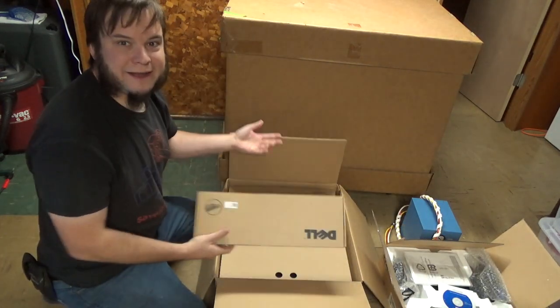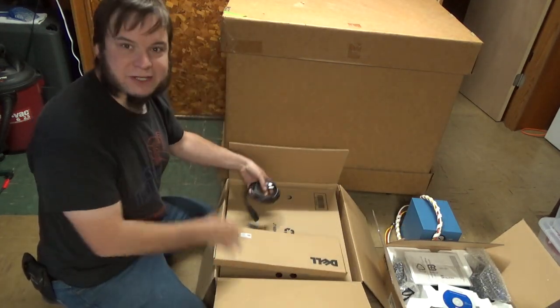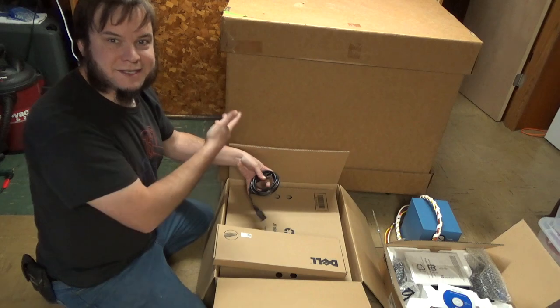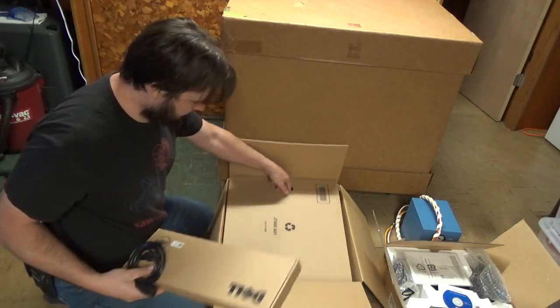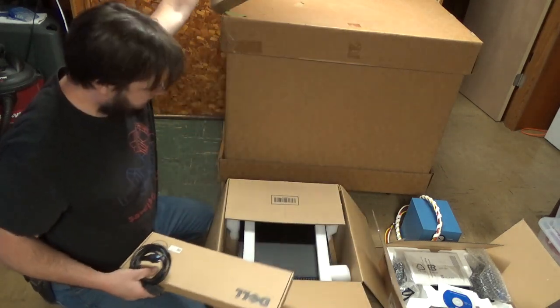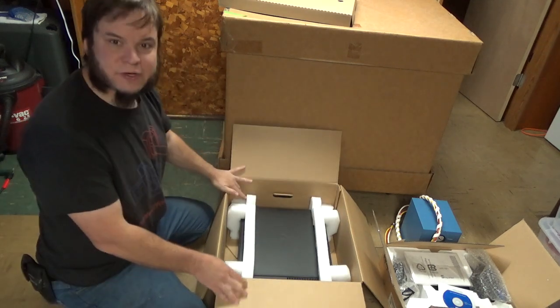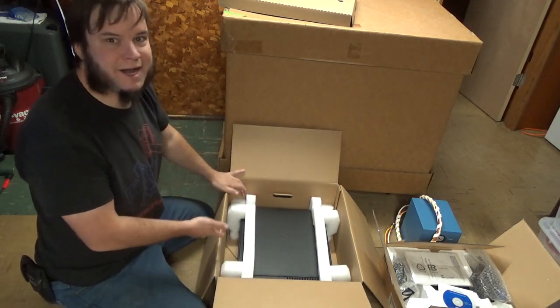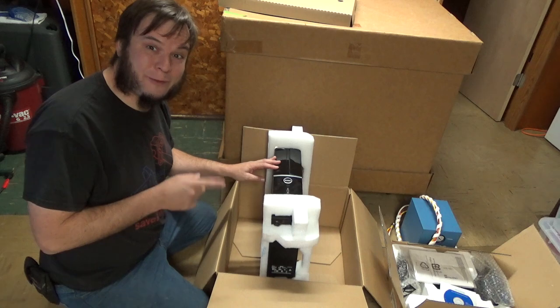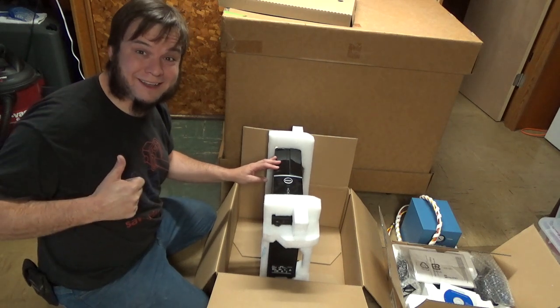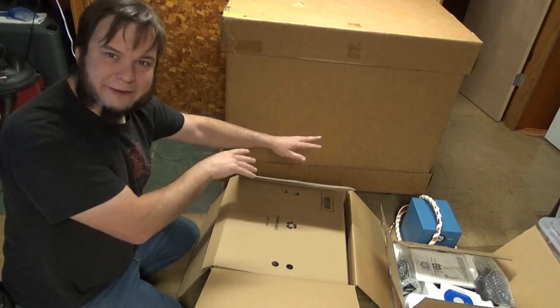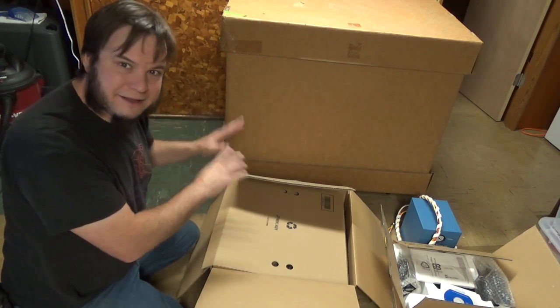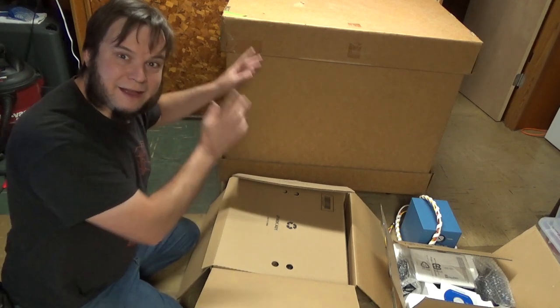Alright and then we've got the computer system that actually runs this laboratory. So again, pretty standard looking Dell desktop. This one's designed for Windows Vista, so you know it's quality. Alright, so aside from the vacuum manifold dingus, this is all pretty generic computer equipment. Let's see what's in the big box.